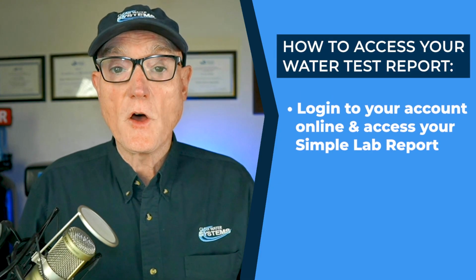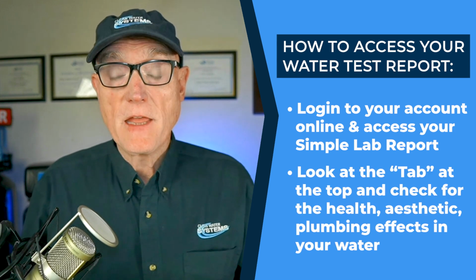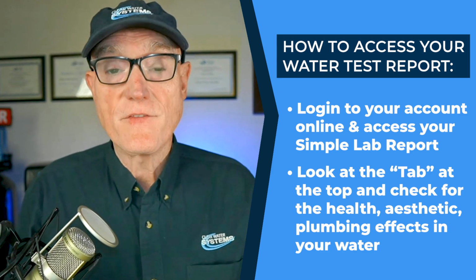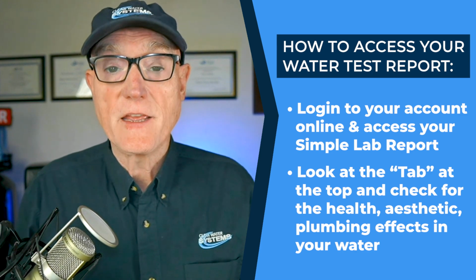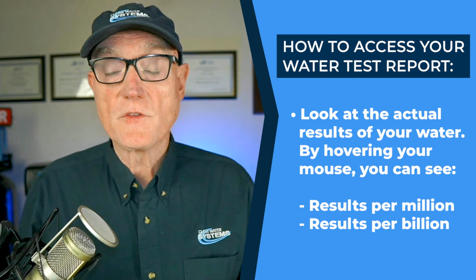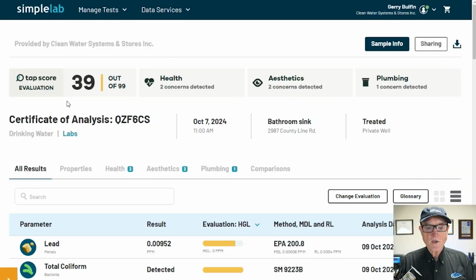Okay, let's get started. So the easiest way to look at this is to log into your account online and access your SimpleLab report. The next step is to look at the tab at the top and see if there are any health effects indicated in your water, or if there's any aesthetic effects, or if there's any plumbing effects. Those are the three main areas that the SimpleLab test report will flag if there's any problems. The next step is to look at the actual results. And you'll notice if you mouse over, you can see what the results are in parts per million as well as parts per billion.